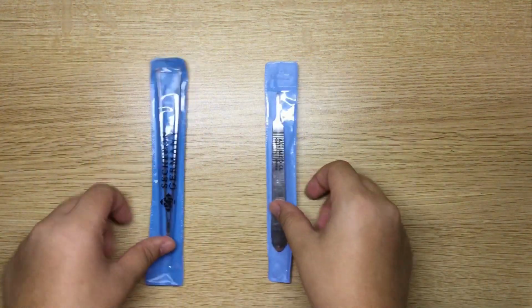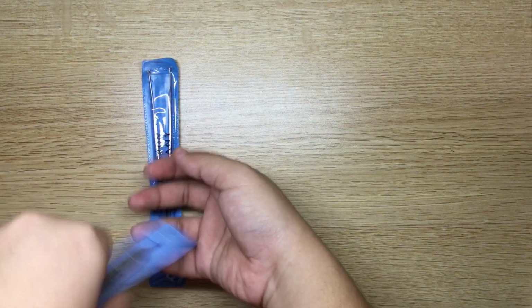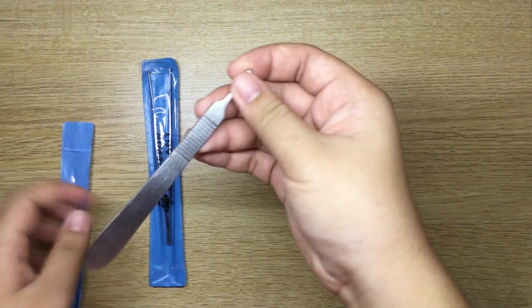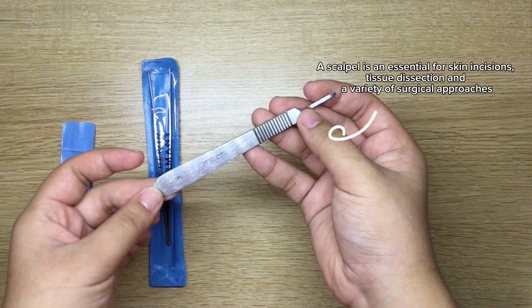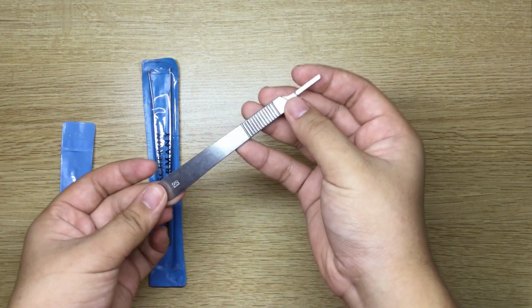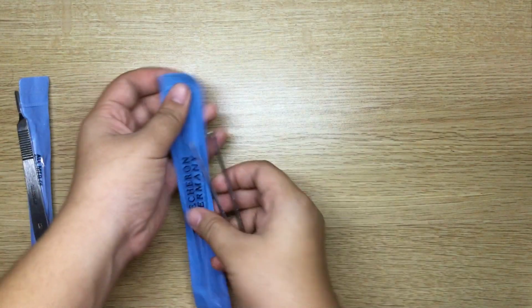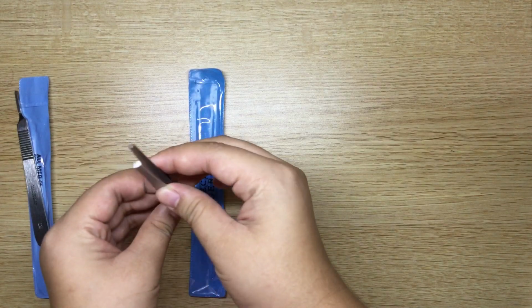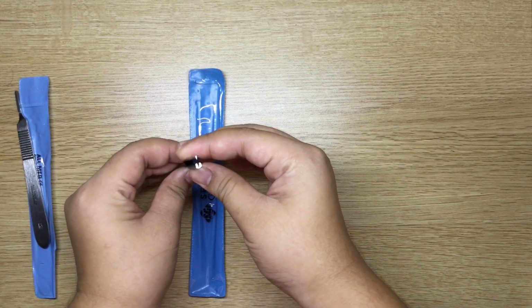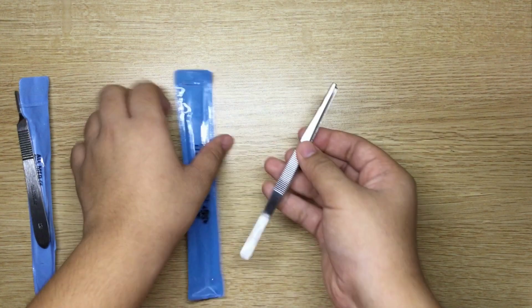Next, we have the scalpel. It can use various blades as long as they are compatible. A scalpel is essential for skin incisions, tissue dissection, and a variety of surgical approaches. A tissue forceps is used to hold and manipulate delicate tissues during surgical procedures or laboratory work.